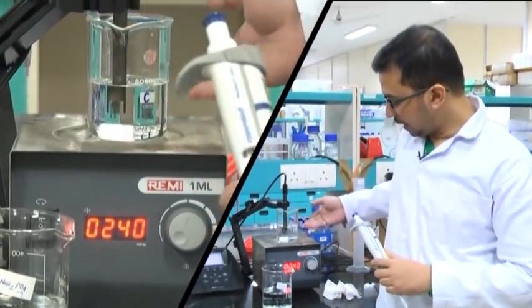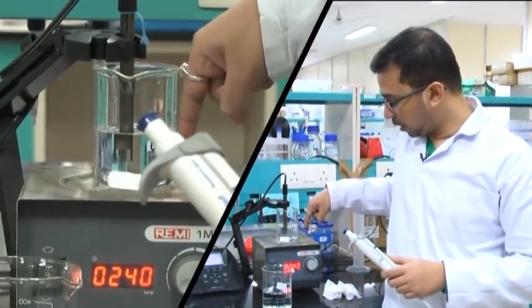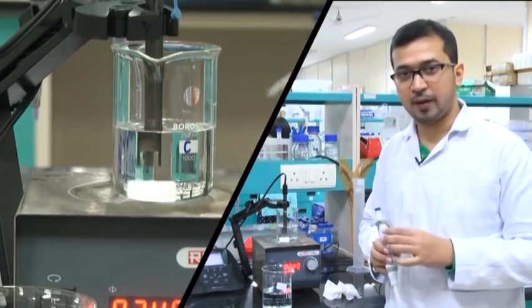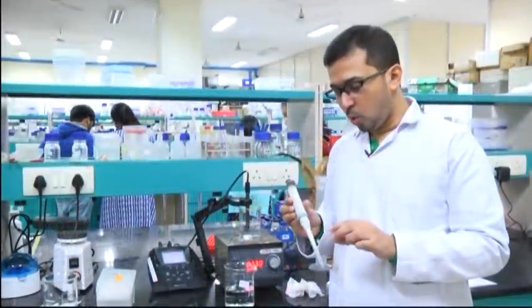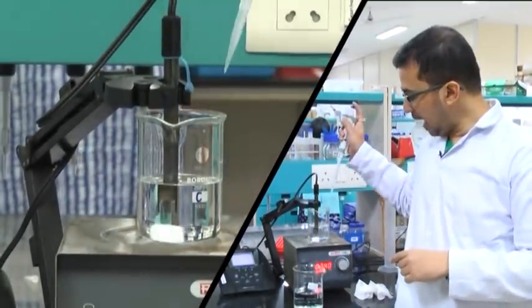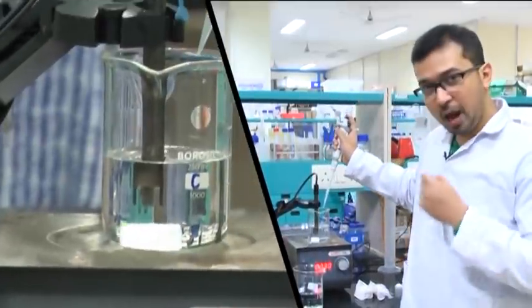We have taken a magnetic bar and placed it in the magnetic stirrer. One thing to be careful about: the pH electrode must not come in contact with the rotating magnetic bar, as the electrode is very delicate and may break or crack. Maintain some distance between the pH electrode and the magnetic bar. I have taken a 1 ml micropipette with a 1 ml tip and will be taking the monobasic solution and adding it gradually drop-wise to the dibasic solution.